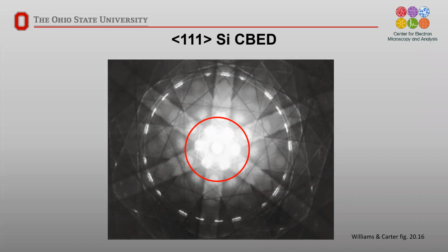If we start to look now at this outer ring, I can see that I've actually got some mirror planes. So from 12 to 6, there's a nice mirror plane. You can fold the pattern over and see that it matches up. You can do it from 4 to 10 and from 8 to 2, and they all match up as far as mirror planes go.